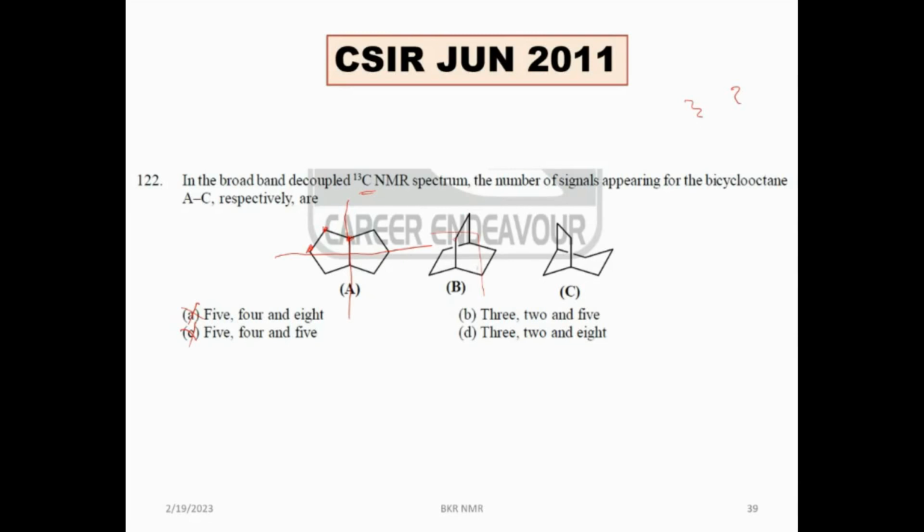அப்ப என்ன ஆன்சர்? 2, ma'am. 2, yeah. So this is this one carbon, this is second carbon. அவ்வளவுதான். ஏன்னா இந்த கார்பன் சேம். அதே மாதிரி இது எல்லாமே சேம். So I have only 2 signals. So 3, this is 3, this is 2.